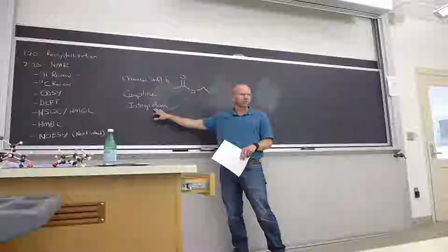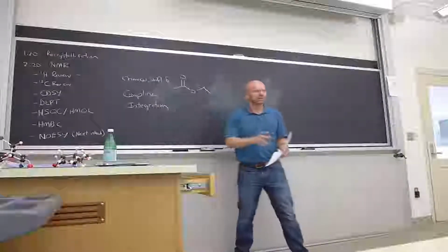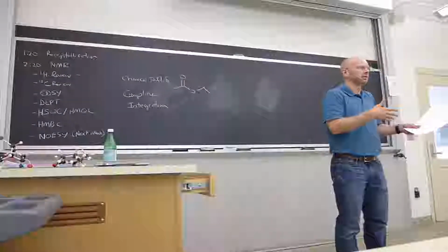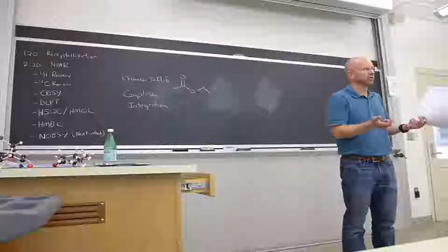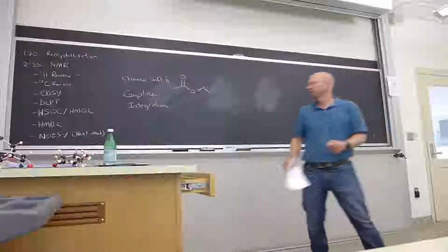Like, where on the spectrum is an integration, and what does it tell us again? Area under a peak. It's the area under that particular peak for a particular group. Okay, so we've all just been saying proton group, proton group, proton group. How do you know that any two protons are in the same group or in different groups? What is the test that you apply to figure out whether two protons are in the same group or another?